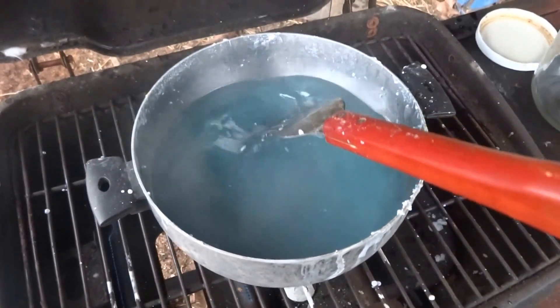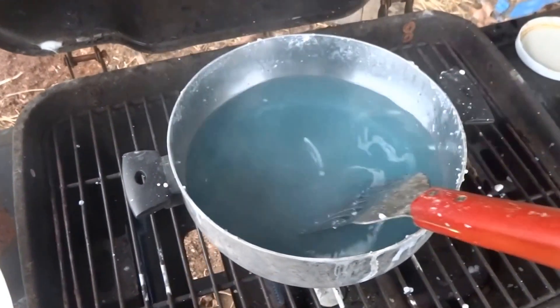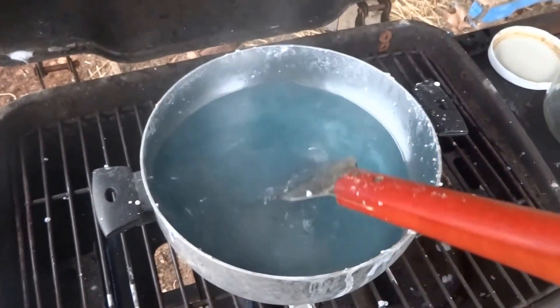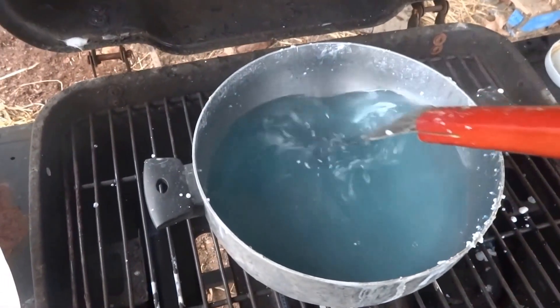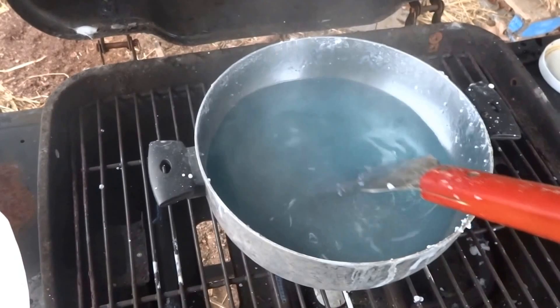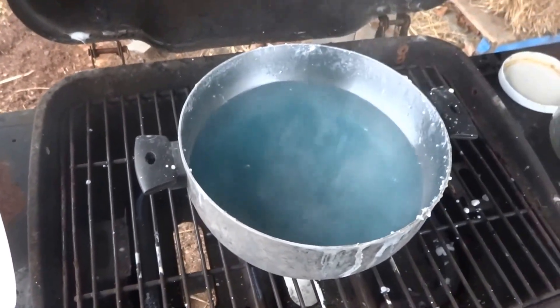Now I've already mixed in all of the silicate solution and it's almost completely dissolved. I've just about got it to where it's got the clear look to it.